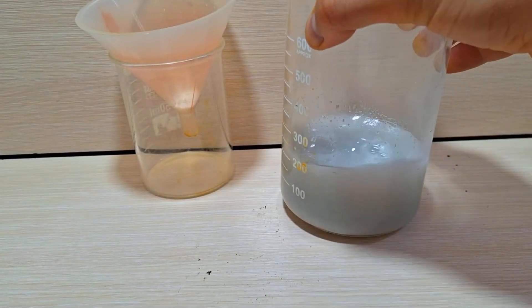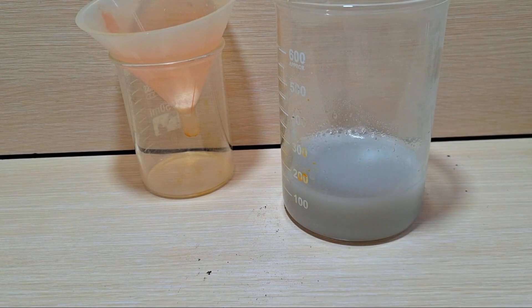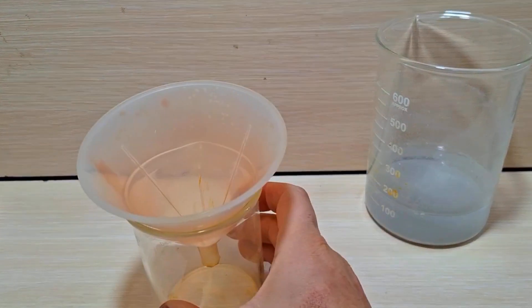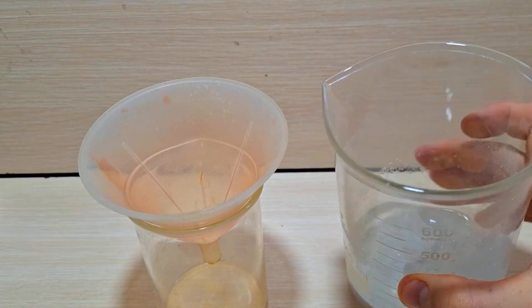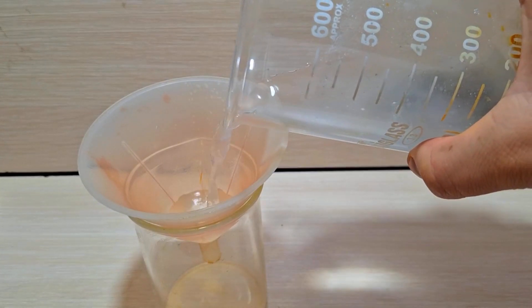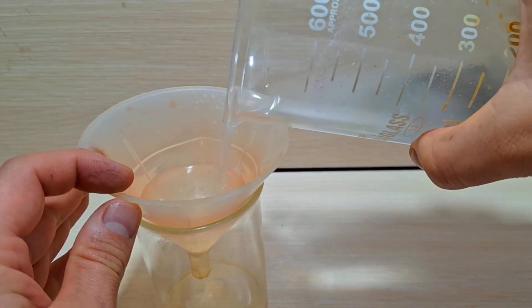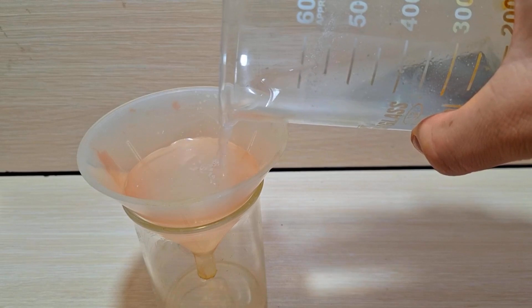If you intend to extract and store lithium as lithium carbonate, after filtering the lithium hydroxide solution, dissolve a small amount of sodium carbonate in hot distilled water and filter it. Then add it to the lithium hydroxide solution. After a few days, white lithium carbonate particles will precipitate in the beaker and will be ready for battery production.